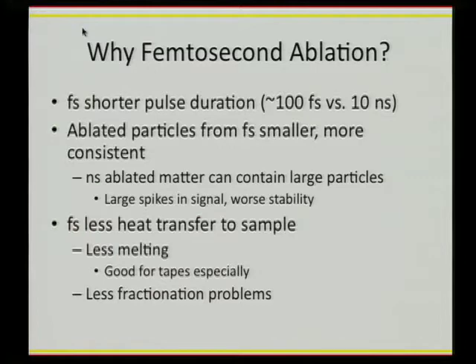So you might be asking yourself, why are we looking at femtosecond ablation? Because if you have a laser set up in your lab coupled to an ICP, it's typically a nanosecond laser. And here I'm trying to convince you that femtosecond ablation is the way to go. Femtosecond ablation boasts a shorter pulse duration, which makes the ablated particles smaller and more consistent than nanosecond ablation.